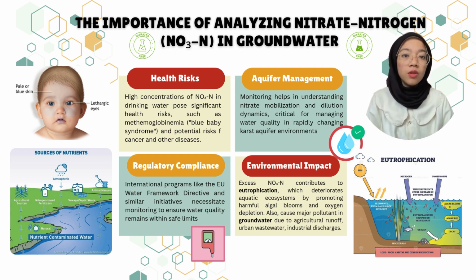Monitoring nitrate levels also aids in effective aquifer management. It helps us to understand nitrate mobilization and dilution dynamics, especially in complex systems like karst aquifers. This knowledge is essential for sustainable water resource management, particularly in regions experiencing rapid urbanization and agricultural intensification.